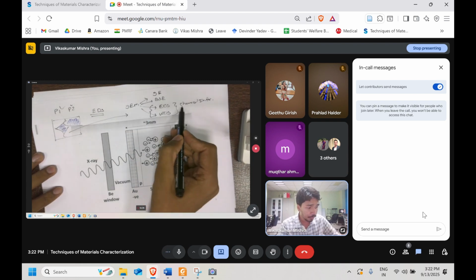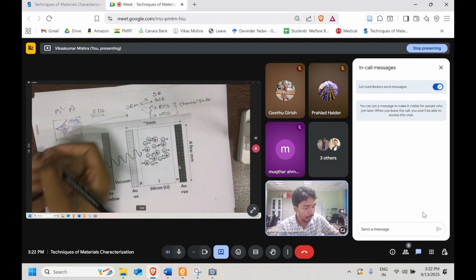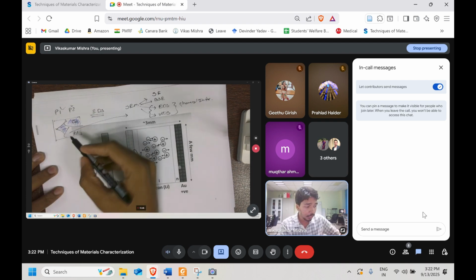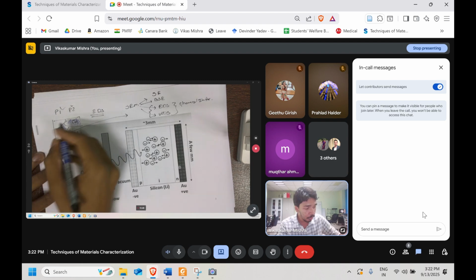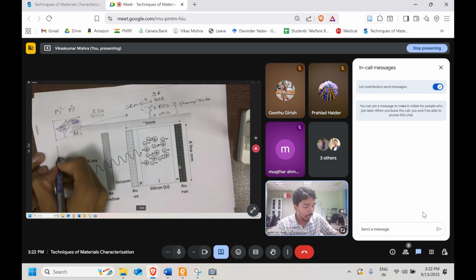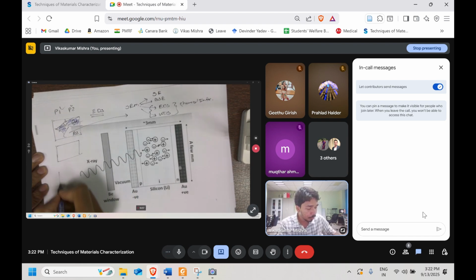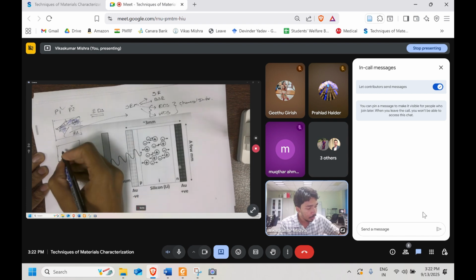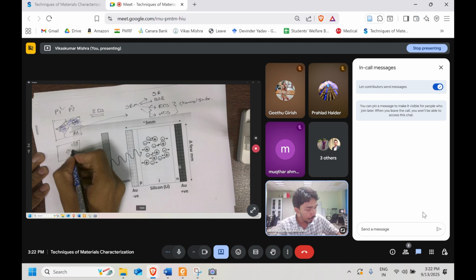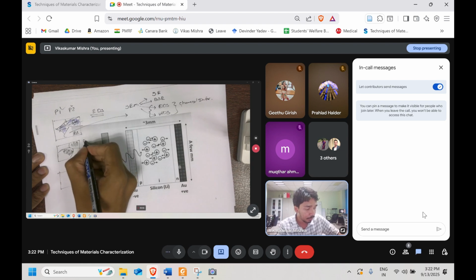So it will tell you, let us say this was the aluminum and this is the copper. It will give you the difference, telling you the copper phases are over here and the aluminum phases are over here. So at the end you can get the mapping also. In the mapping, let's say this is the copper phase. So you got the copper phase something like this. You will get some color over here. Let's say copper, we can assign the black color.